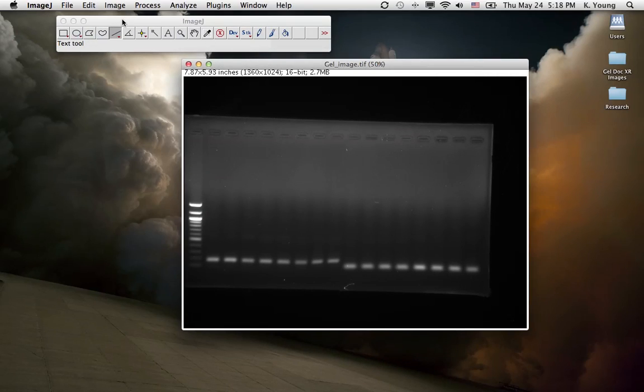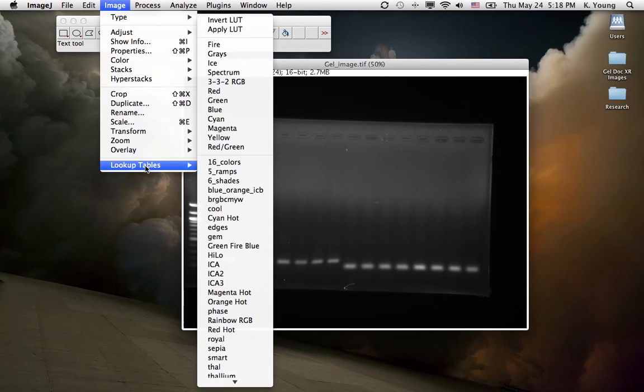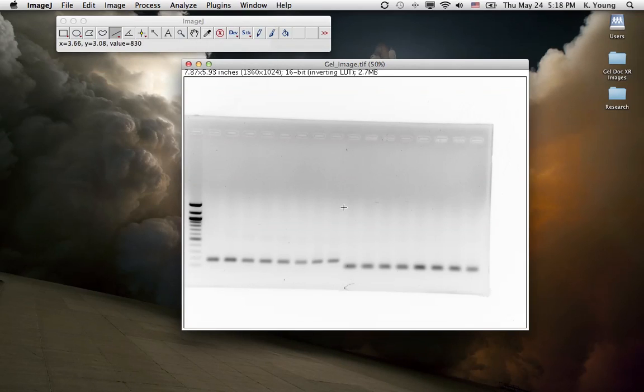After that, what we want to do is click on Image, click on Lookup, go to Lookup Tables, and click on Invert. It's going to invert the image so the bands are black.